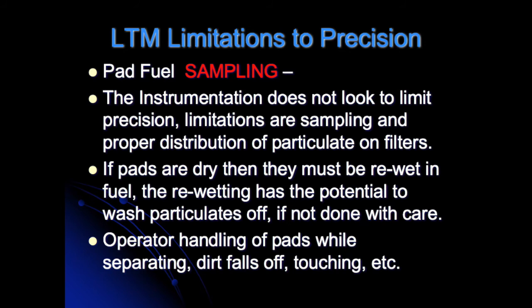What are the light transmission method limitations to precision? Pad fuel sampling is a huge limitation because collecting and sampling the pad properly involves significant human error. The instrumentation does not appear to limit precision. Limitations are sampling and proper distribution of particulate on the filters. If the pads are dry, they must be re-wet in fuel, and re-wetting has the potential to wash particulates off if not done with care. Operator handling of pads while separating — dirt falls off, touching, etc. — means the largest limitation to precision is the preparation of the sample pads, which is the exact same limitation shared by all other test methods.